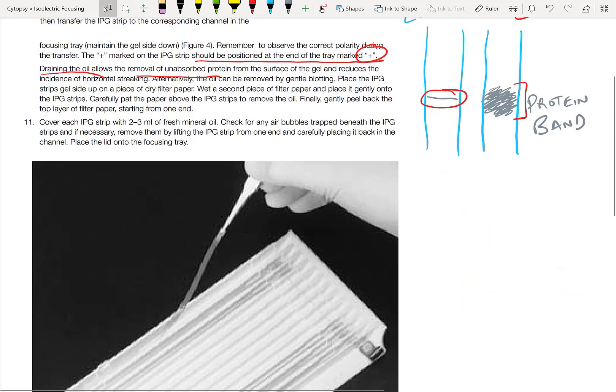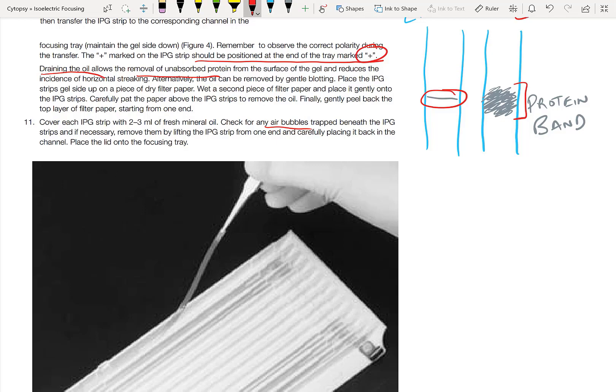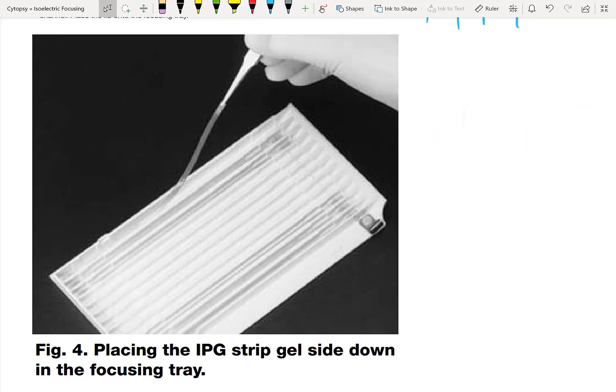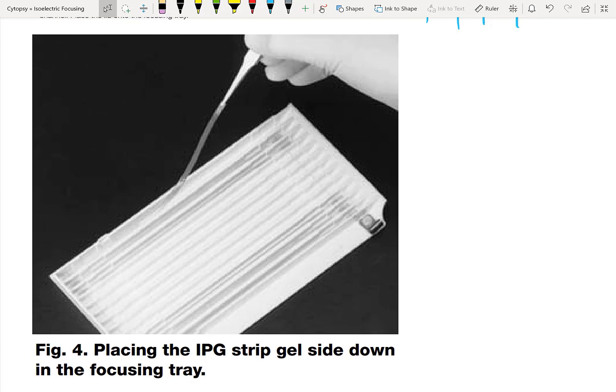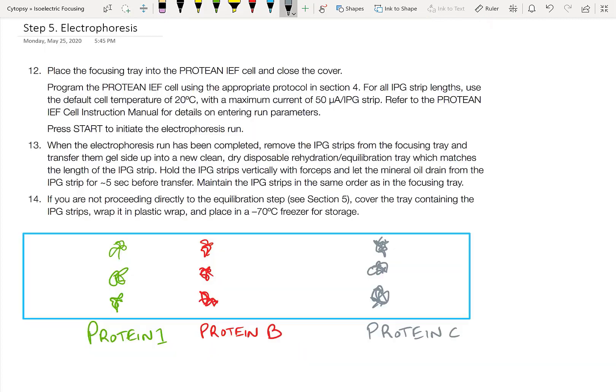Make sure that the IPG strips are clear of any mineral oil and unabsorbed protein on the surface. Finally, make sure there aren't any air bubbles. Once again, that's going to prevent the IPG strip from working as intended. Here you can see what it's like to place the IPG strip gel side down into the focusing tray. Very simple, just like before using forceps. Finally, we take that IEF gel which has already been in the focusing tray and then put it into the instrument. In BioRad's case, it's called the PROTEAN IEF cell. You click the start button and look here.